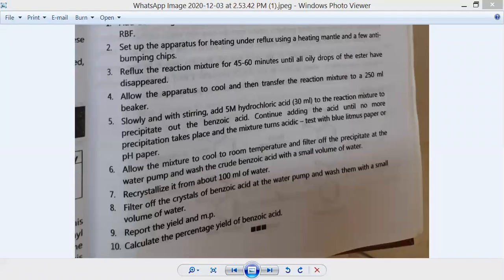समजतंय? माया, इट हॅज गॉन इनसाइड. नाउ आय थिंक होप आय एम Yes, क्लिअर. madam. आता समजलं? आता समजलं?